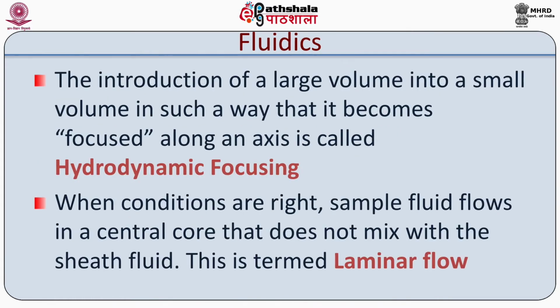So as the flow of sheath fluid accelerates these cells and restricts them to the center of the sample core, this process, when multiple flows with substantially different flow rates come into contact, resulting in centering of the core stream and the sheath stream, is hydrodynamic focusing. The sample core flows separate but coaxially in a central core within the sheath fluid without mixing with the sheath fluid, based on the principles of laminar or streamline flow.